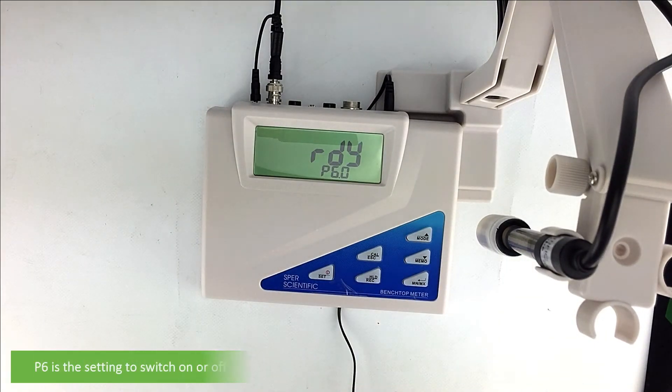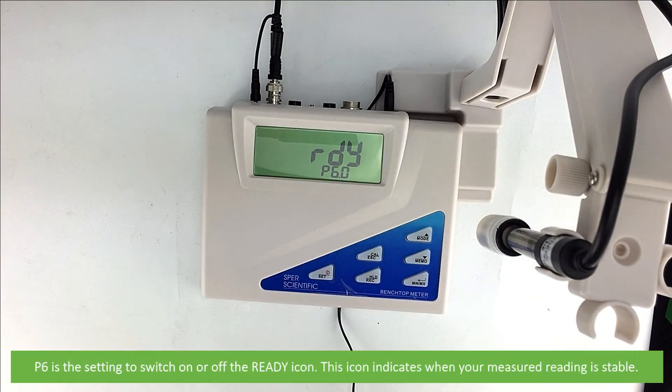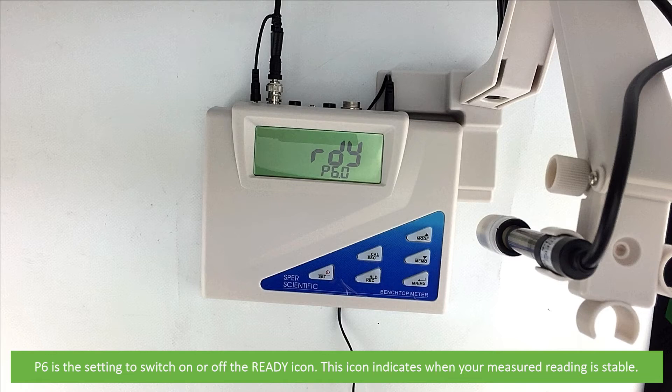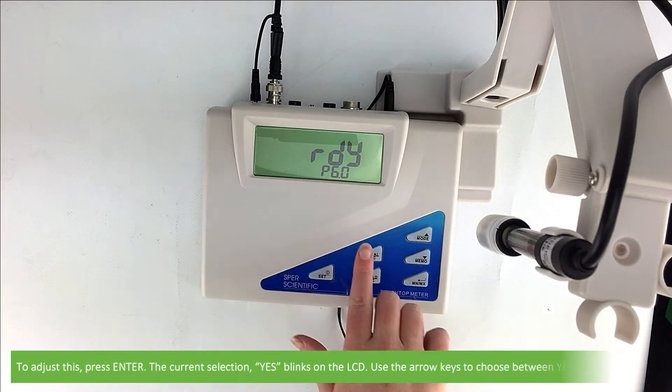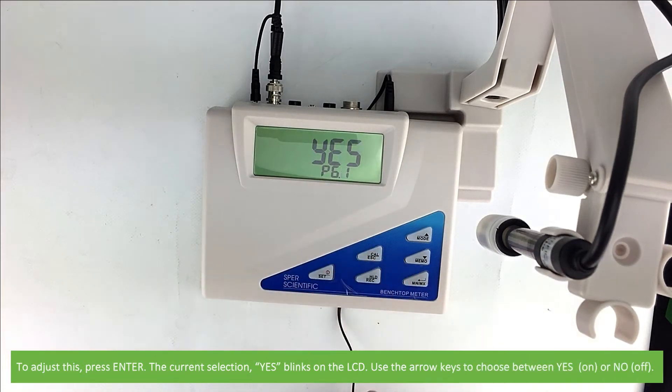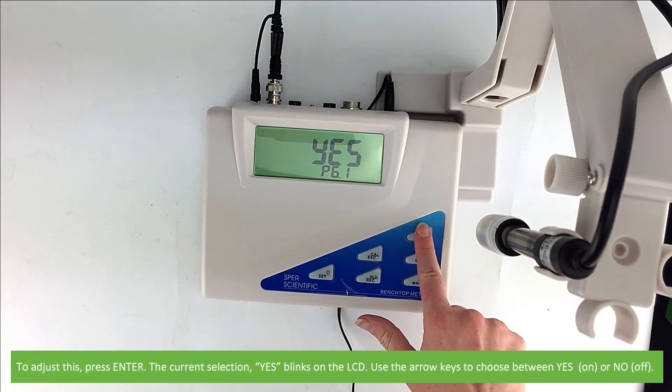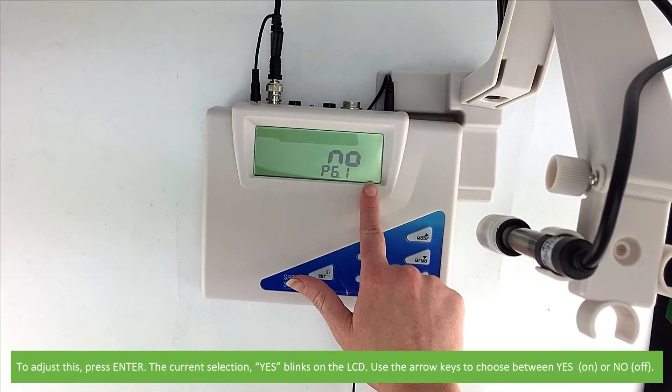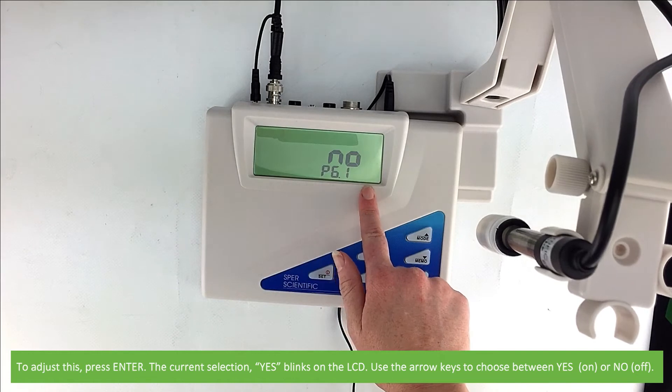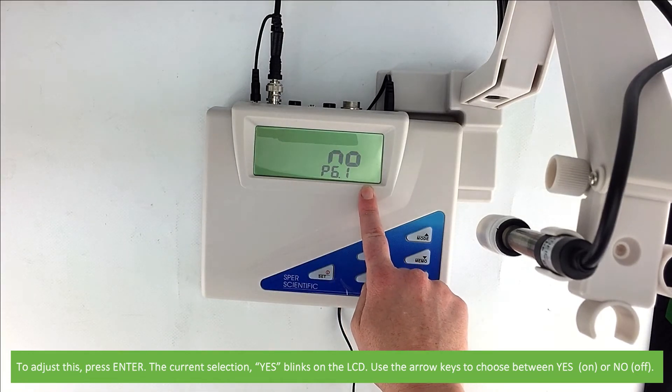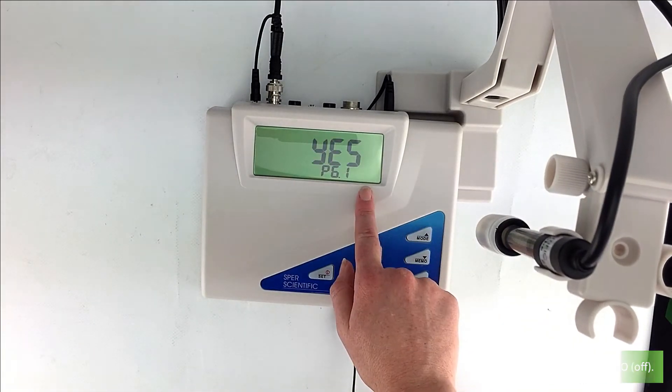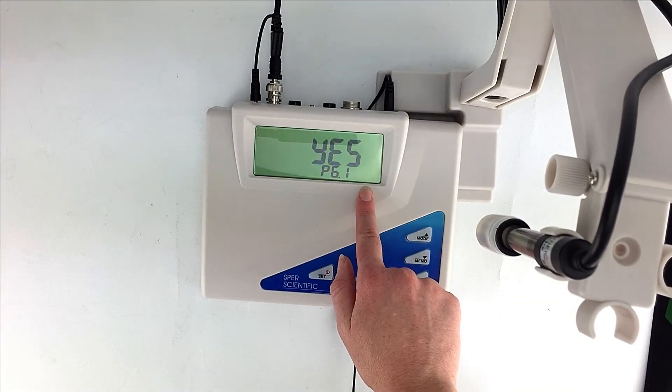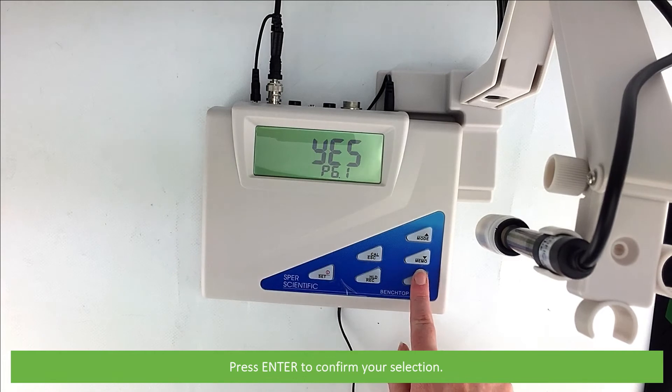P 6.0 is the setting to switch on or off the ready icon. This icon indicates when your measured reading is stable. To adjust this press enter. The current selection blinks on the LCD. Use the arrow keys to switch between yes which is on or no which is off. Press enter to confirm your selection.